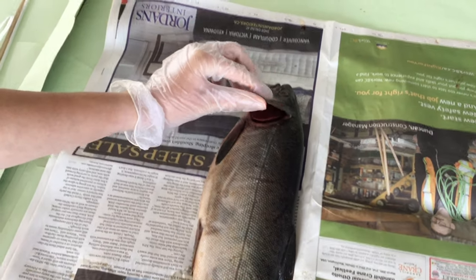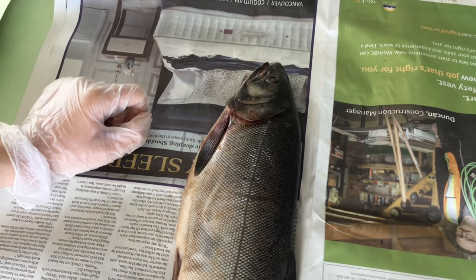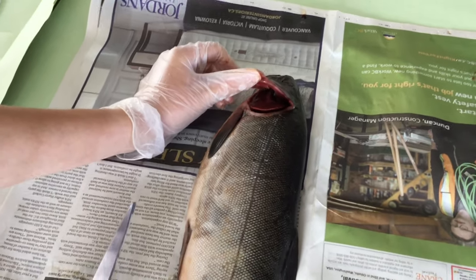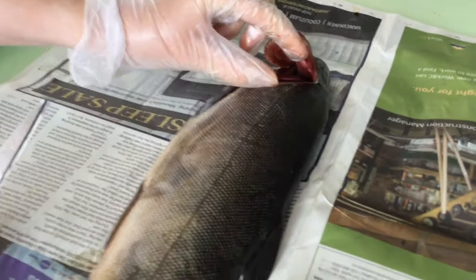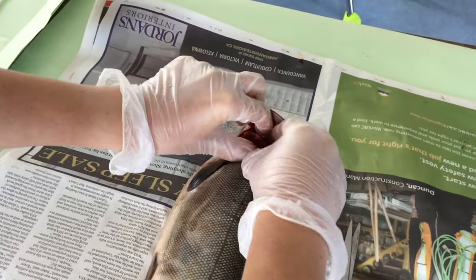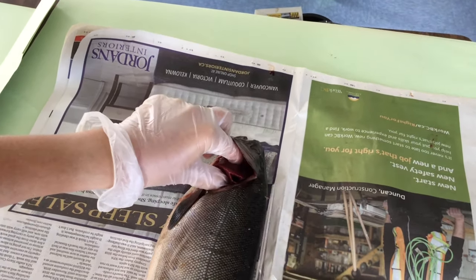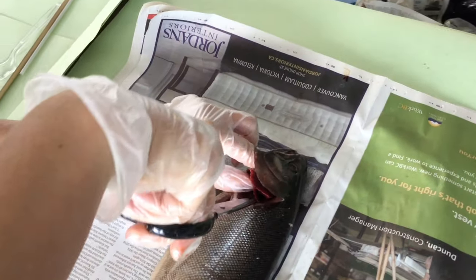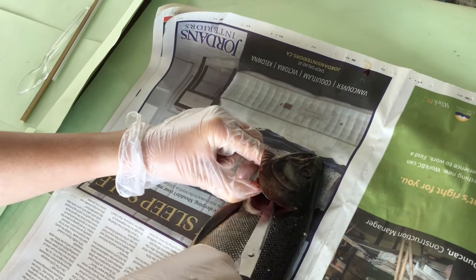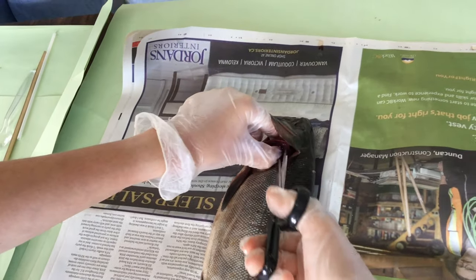Okay, so now that you've drawn your gill cover on, now we are going to remove the gill. This is our first going into the actual salmon. And Alicia is going to begin cutting, detaching. Now, the salmon has gills on each side. So if we are unsuccessful in getting this one, we can still try on the other side. See, this is hard. It's tricky.